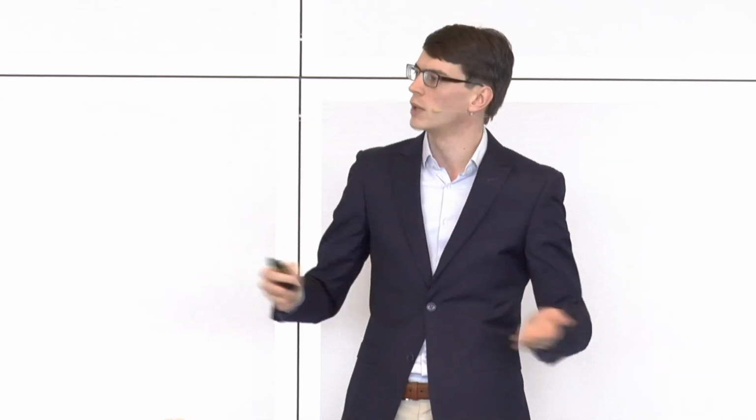So what you can see here in the schematic in the bottom right is that this gray area is water, and then the small strands that you see are small sugar strands which hold the water together. In light gray, it's a very coarse structure. And if we add some kind of fluorescent molecule or fluorescent particle in there, then those particles can move around quite freely. They are somewhat hindered by those polymers, but most of the time they can move freely around. There also exist very dense structures, and in there, each protein, or each polymer in this case, is very much more restricted in its movement.